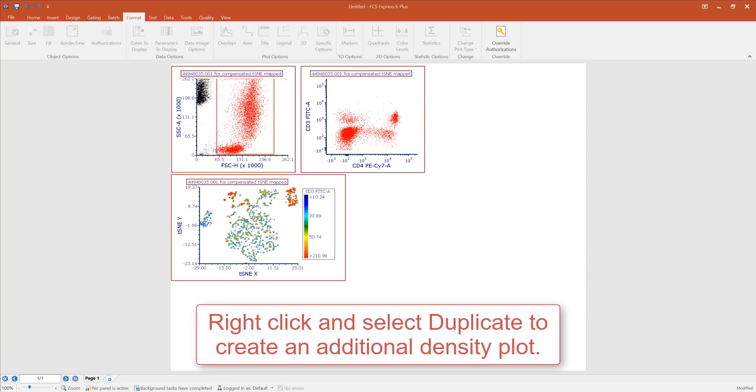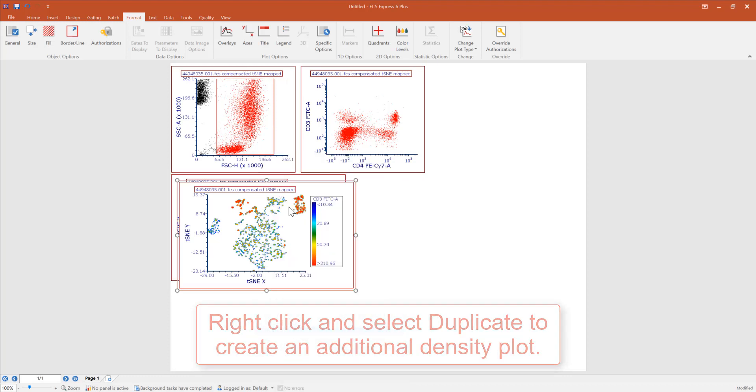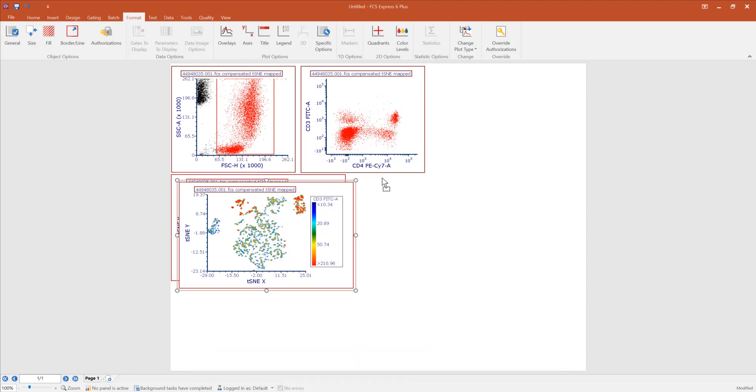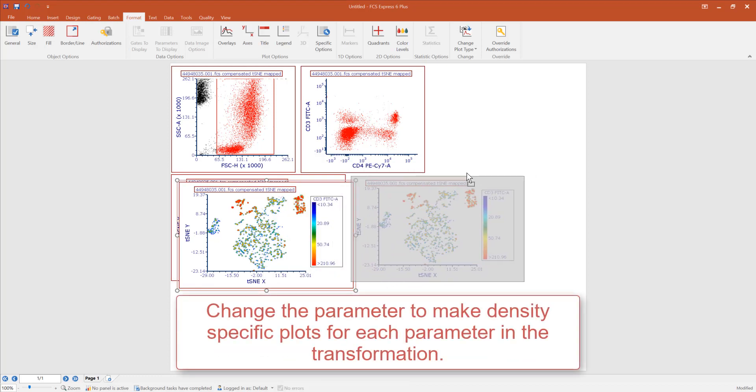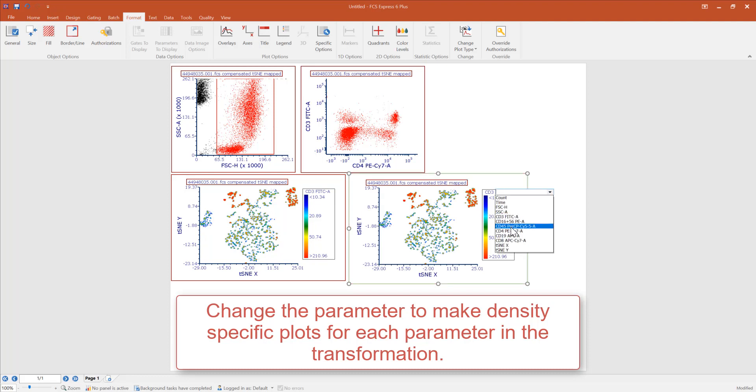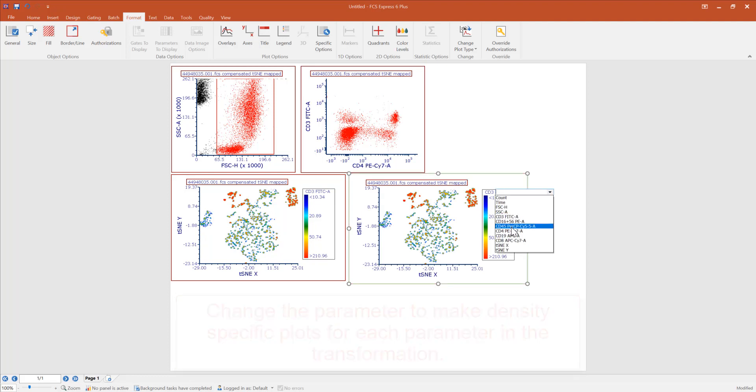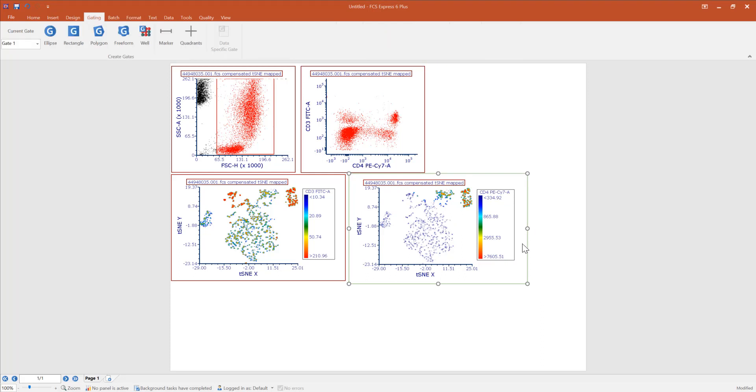We may duplicate this plot by right clicking and selecting duplicate and change the parameter found in the legend to create a t-SNE heat map for each parameter found within our transformation.